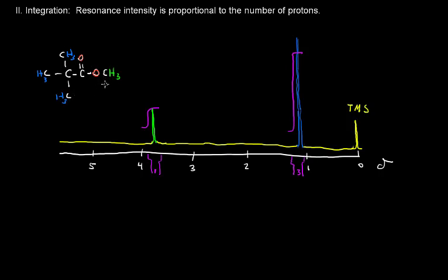So there are two ways that spectrometers often report these integrations. Newer ones often will mark the region where a resonance occurs below the spectrum, as I've shown here, and give you a little number there. And we see the same thing with this resonance here. And the spectrometer will give you a numerical ratio between these integrations.